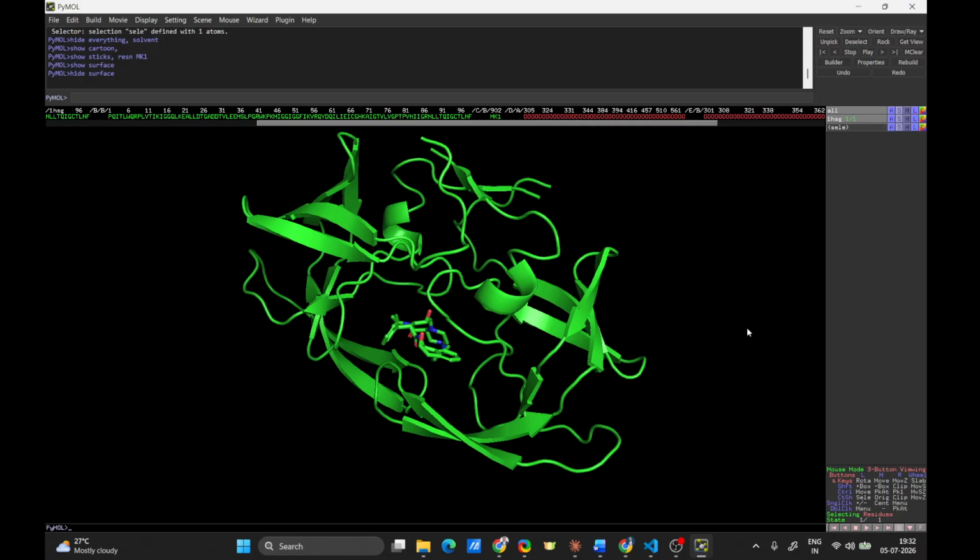So if you want to also become an expert in molecular visualization, specifically with PyMOL, I have already told you, you have seen how I can run these commands very, very quickly. This is because I have created those courses. Those courses contain all the details of how you work with different commands, including color, label, show, hide. All those things are already there, right? This is just a trailer for that particular course, and I hope it is also useful for you to understand how effectively you can use PyMOL, and in a very, very short period of time you can play around with the structure effectively.